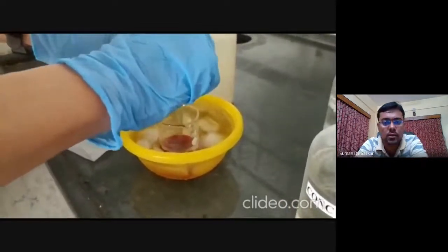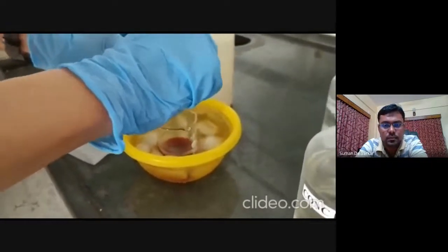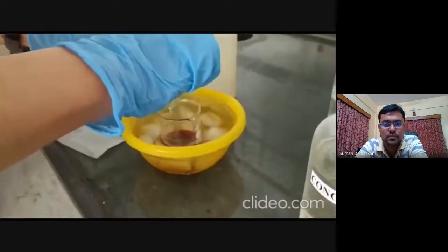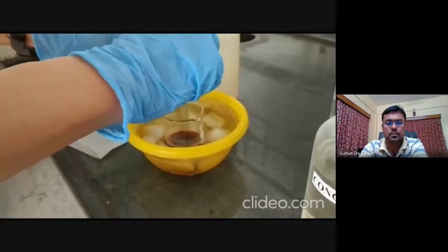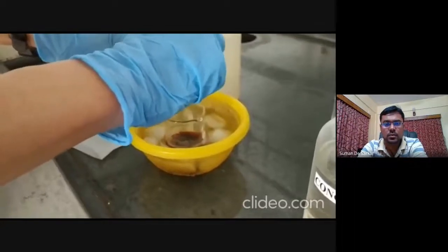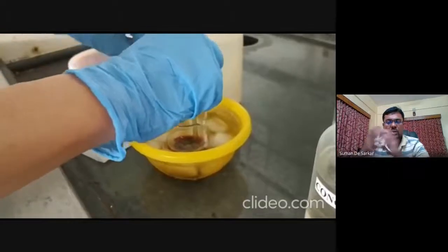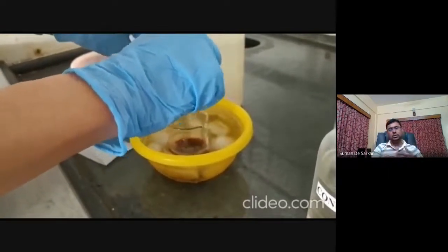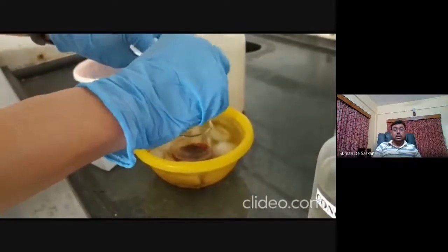Soon the intense color will come. Red color of methyl orange appears. It's too intense, right? It looks like black, but same like indigo. It's too concentrated. When we dilute it, or during filtration, we'll see it's basically the red color.